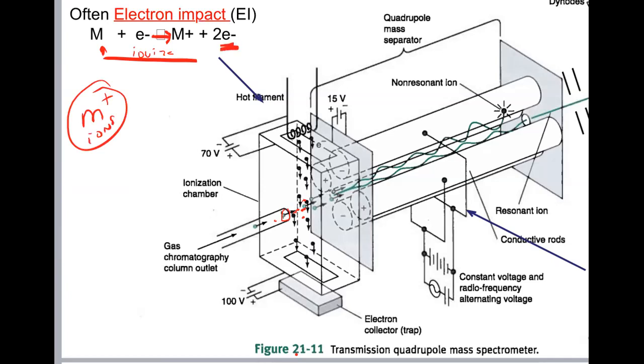And it says here 2 electrons are produced. Well, one came from the molecule. The other one is just the one we started with, okay? So we produce a net 1 electron, if that makes sense. And we make the M+ ions, more importantly, right in this region and through here. So this source, all it does, this electron gun, basically collides with our molecules to produce ions of a molecule.